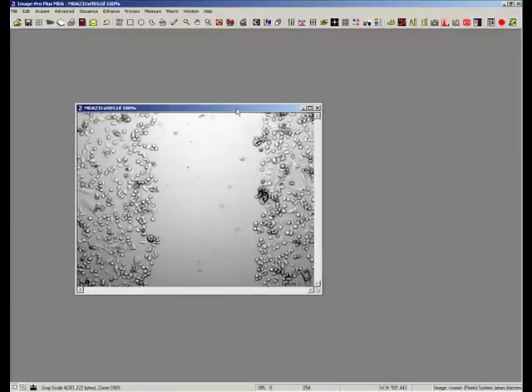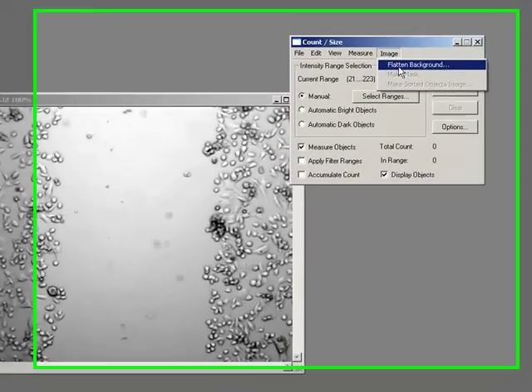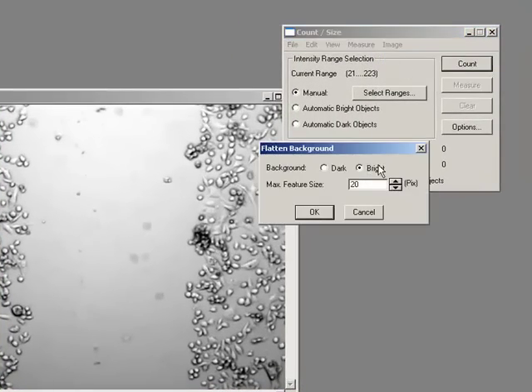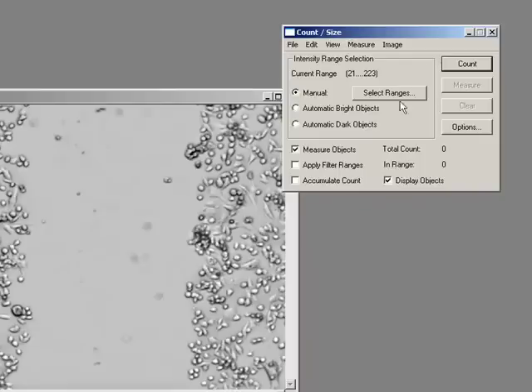Most wound healing images tend to be phase and they tend to all have illumination issues — this seems to be the standard problem. You can set up your microscope with Köhler illumination, which can be found on the web, or we can just do from the count size dialogue: flatten background, bright background. That seems to even everything out.